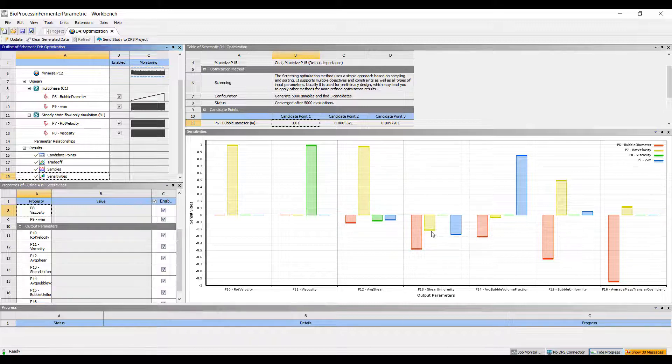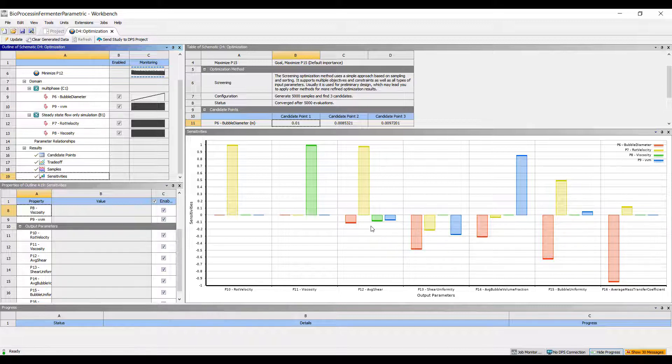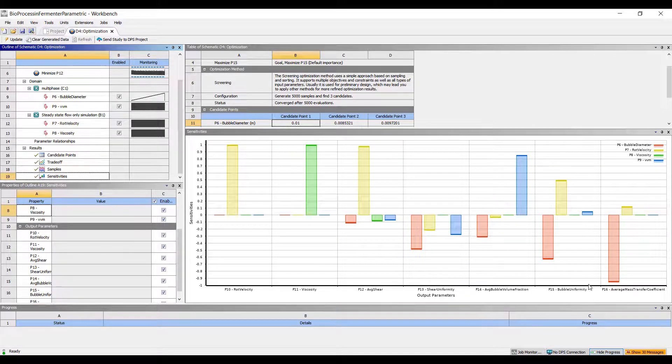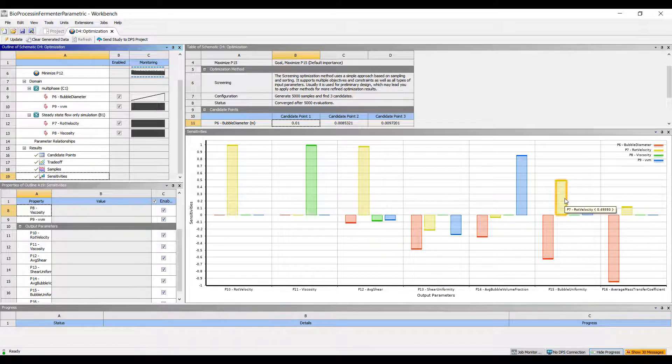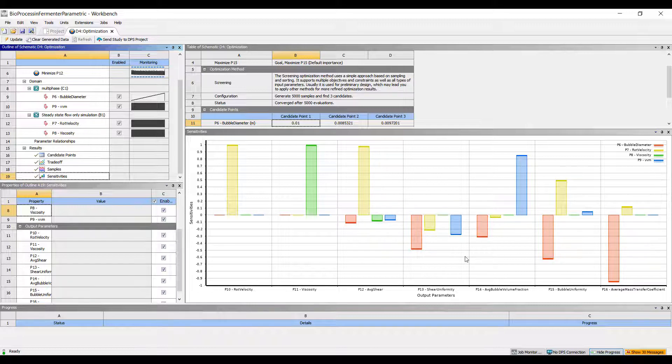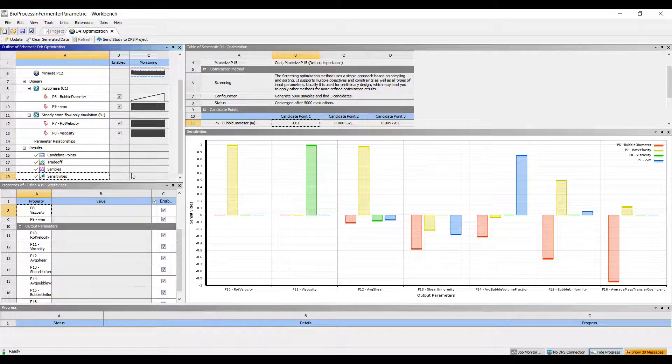Some of the things that's very important to control in these models is how big the bubbles are that I'm putting into the system. If I'm looking at uniformity and the average shear, then how fast I'm stirring it becomes important as well. This gives you a lot of insight in terms of what's important and what you need to control well in your bioreactors.